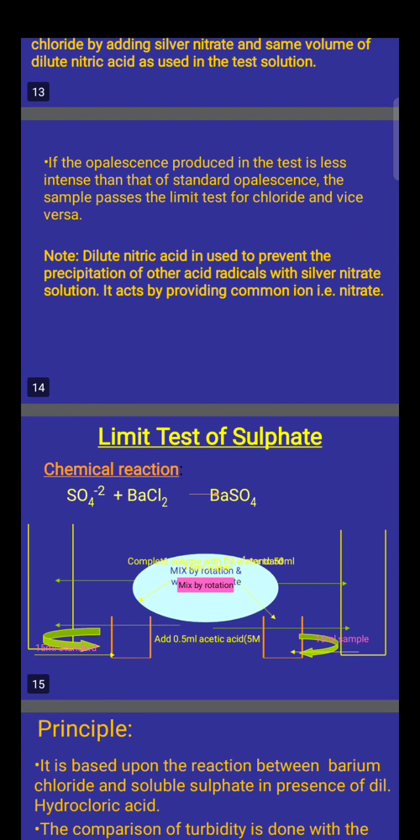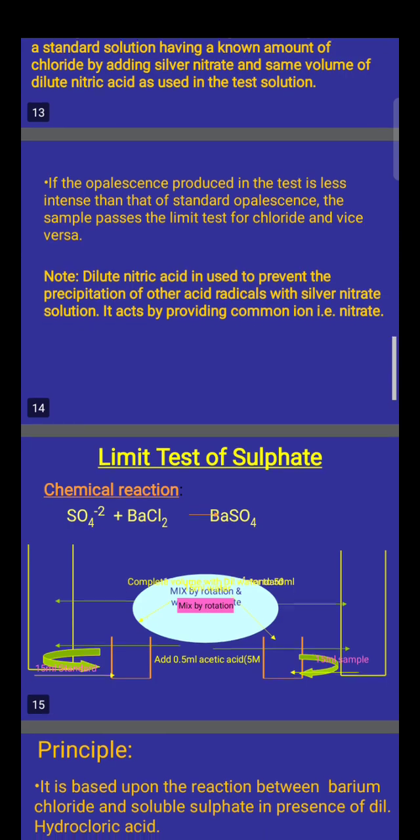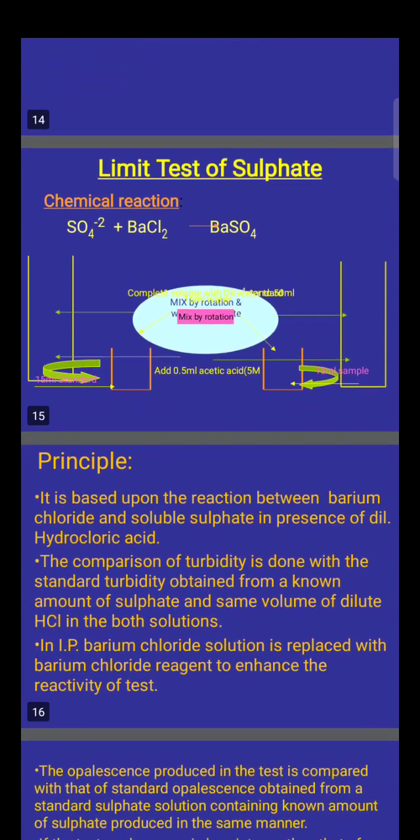I hope you will understand the importance of the limit test in industry, how it determines the smaller amount of impurities present in the sample by just a comparison method. Then second, we will see the limit test for sulfate.